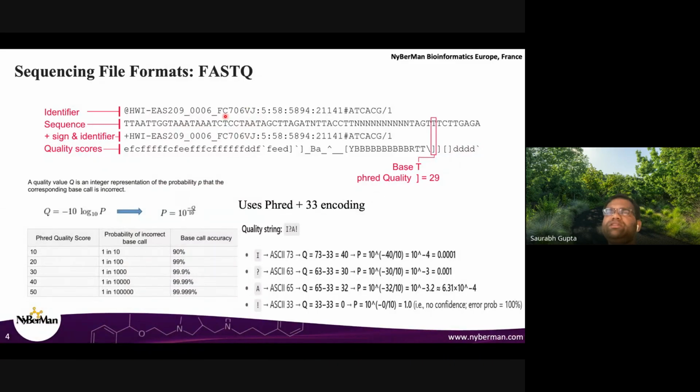In sequencing, you can use indexes, basically barcodes, to pool multiple samples and sequence them on the same lane, right? Remember I mentioned that we can have, let's say, 100 million reads for a lane, but we only need 25 million reads for one sample for RNA-seq. It means we can sequence 4 samples in a single lane, right? How we separate them out is based on this barcode sequence, which we add at the start before sequencing. So this read ID also comprises that. All right. Any questions now?